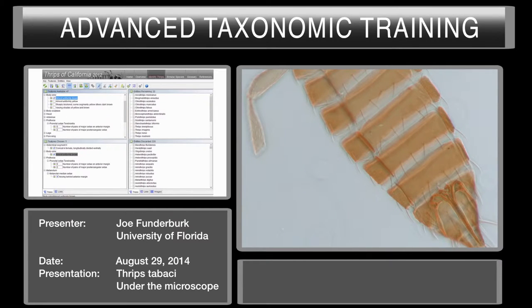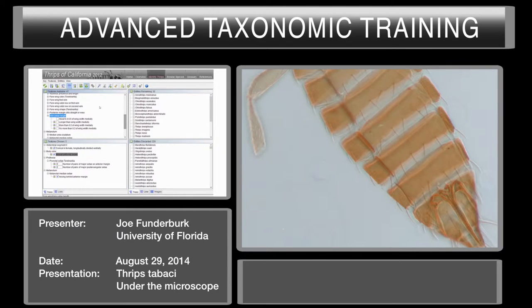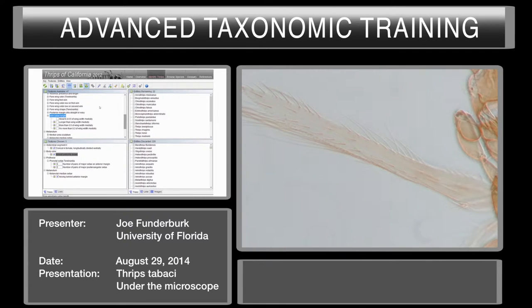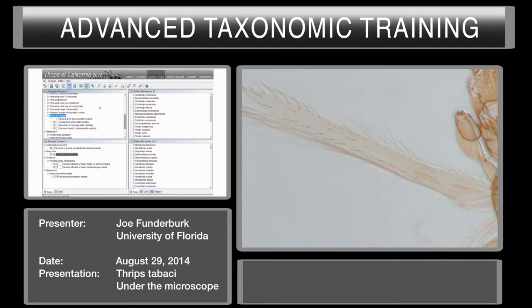Now going to the next best character, we're down to 22 species. It's asking for vein CD length medially. That's a little bit difficult to see at this magnification, but I think we can see it clearly enough. It's pretty obvious that we would say between 0.3 and 0.5 of wing width medially. Based on experience, sometimes you get a little confused — if you're not sure, you could go on to the next best character, but it seems clear enough.